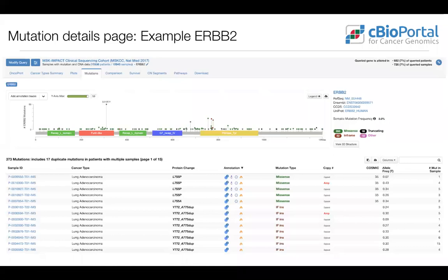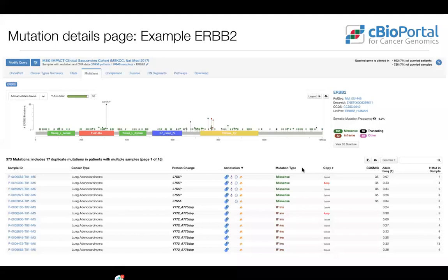This is a view of ERBB2 queried across different cancer types in the MSK Impact Clinical Sequencing Cohort published in Nature Medicine in 2017. You can see where in the protein the mutations fall, with the most recurrent mutation at S310 and a couple of recurrent mutations in the kinase domain. There's a tabular view below showing whether or not a mutation is a driver, with different annotation sources and many other details.